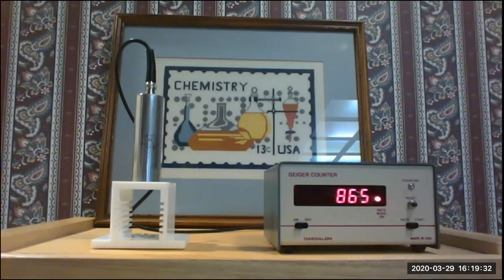And I just reread the directions for this experiment, and it said to go out to 10 minutes, so we're going to go a little bit further. Four at 5 minutes.